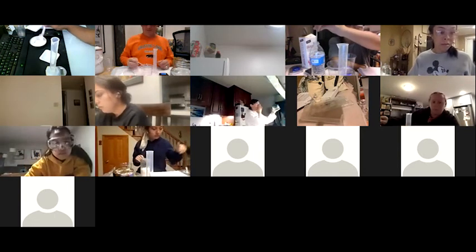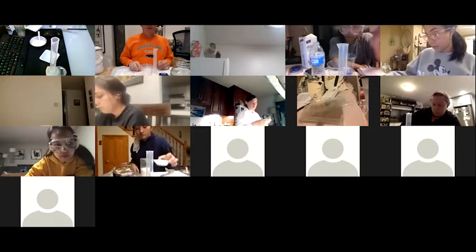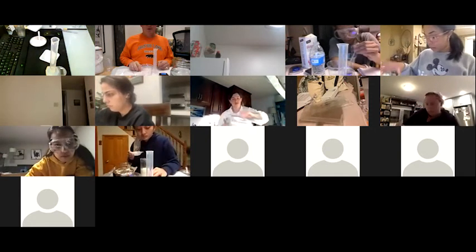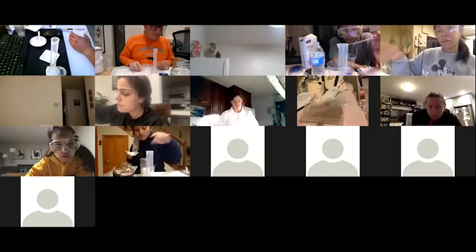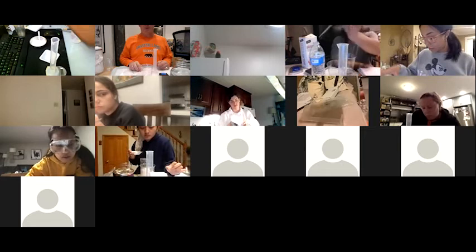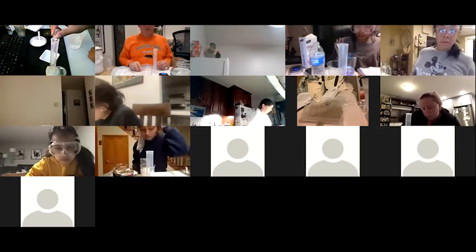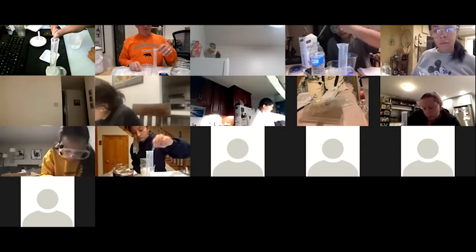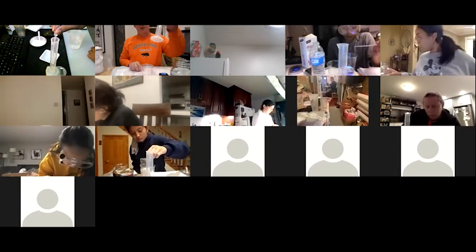I put some water into one of the cups, and when I tried to measure it with the weight, it didn't give me a number. It just said OL. Oh, over. Make sure you're on grams. If you're on carats or something, then that'd be way over. No, I am on grams. Well, I think these go up to 100 grams, so that should be fine. This weighs around 30 grams, and then 50 grams of water should be around 80. So you shouldn't be over 100.